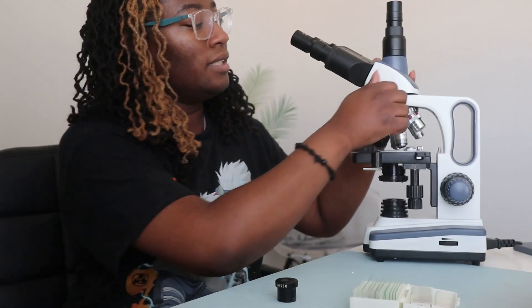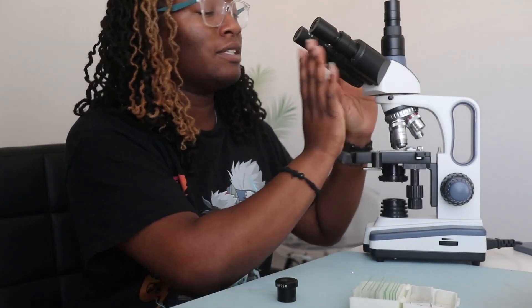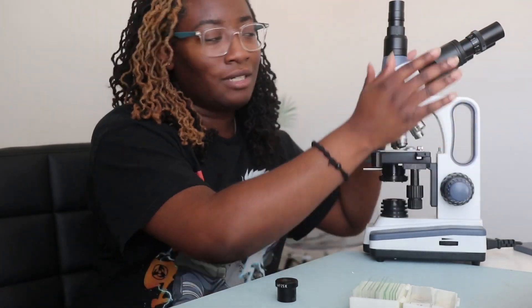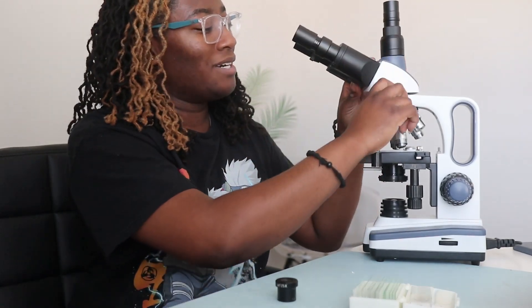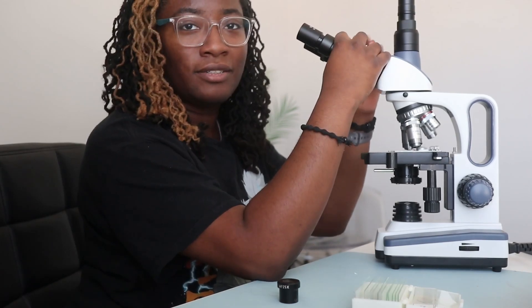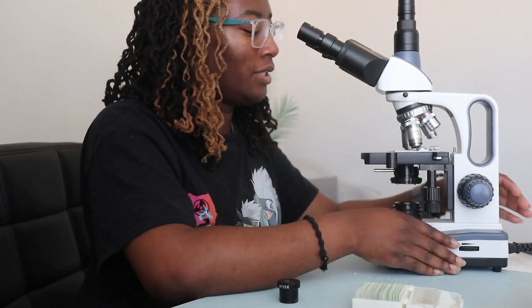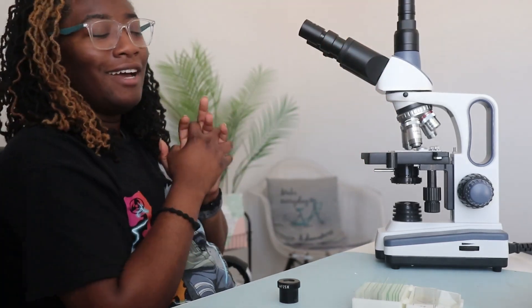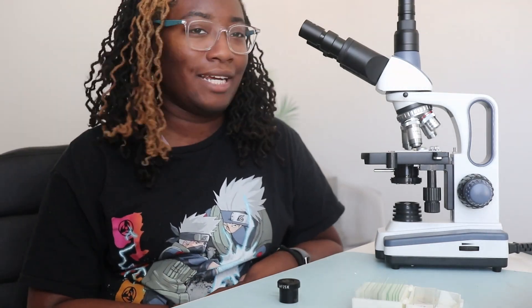The swivel head is really nice because if you wanted to quickly show somebody, you just turn it like that — you don't have to move the whole entire microscope. That part is nice, it just makes a weird noise which I'm not used to. This is at a 30-degree angle so you don't have to worry about getting a crick in your neck, but it is not adjustable — it does not move up or down. So what you get is what you get. Just find an adjustable chair if you plan to use this sitting down.